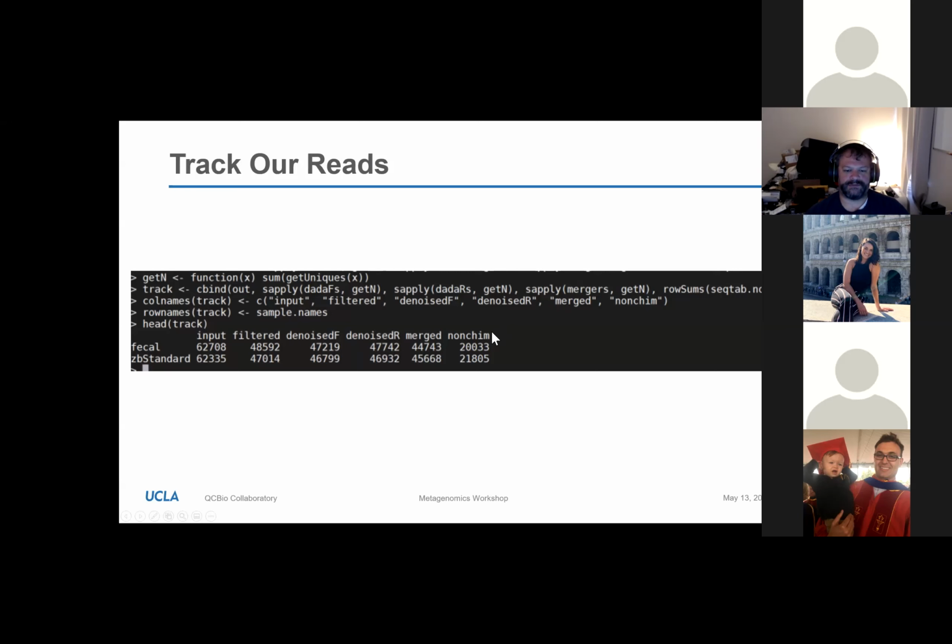And then we ended up losing actually more than half our reads that made it to the merge because they turned out to be chimeric. So what this would actually tell me is I might want to go back and check on my library prep method because I might be PCRing too much, or I might have some other issue that's causing me to generate a lot of chimeras.